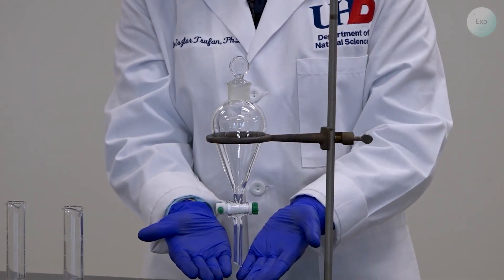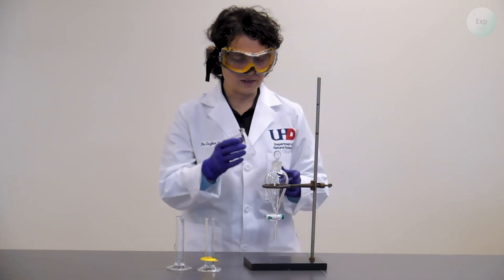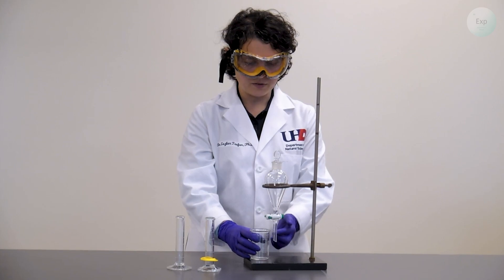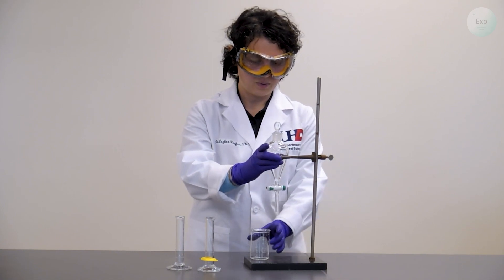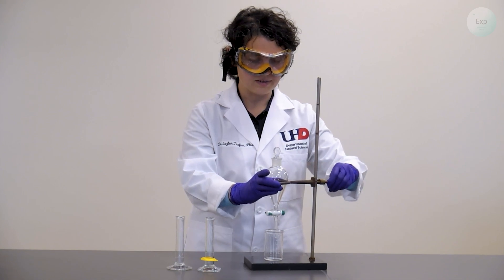There should always be something on the bottom of the separatory funnel, usually a beaker where we collect our solution. The tip of the separatory funnel should be below the top of the beaker. To adjust the height, we disconnect, place it, and lower it a little bit so it doesn't splash out.